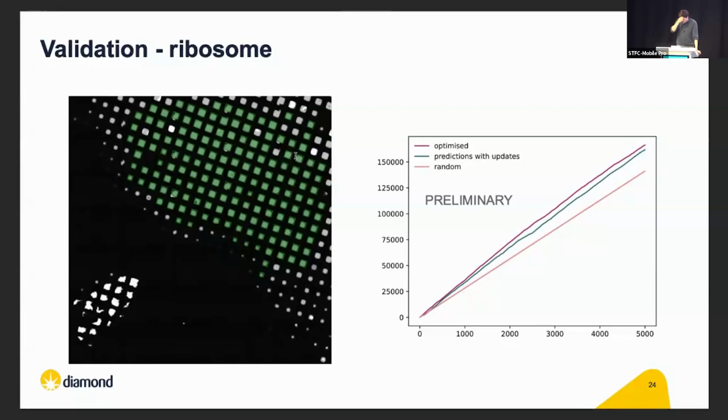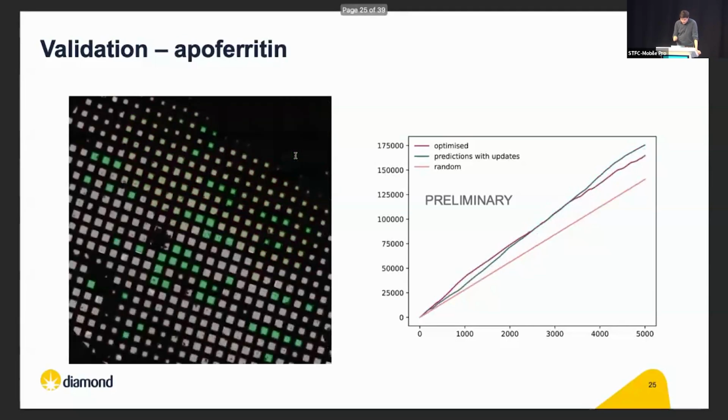So in this case, you see the green and red lines are quite close to each other. You're far away from the random line, which is where you want to be. So decent performance here. This one goes a bit weird because the thing actually overtakes the optimized version, which I'm pretty sure is because of a quirk of how I've constructed that metric. It's an imperfect construction, but the key is that the performance is effectively within range of that optimized line that you're aiming for.